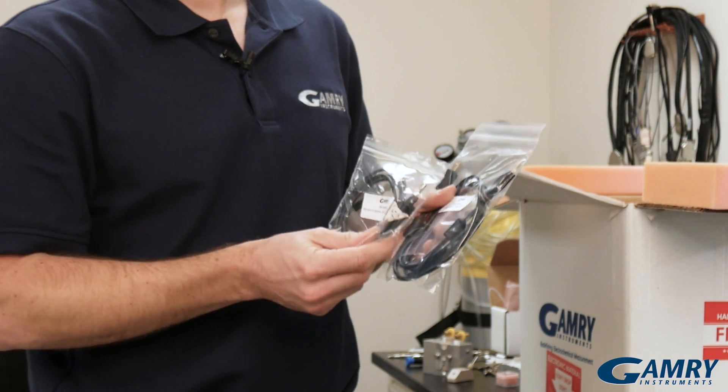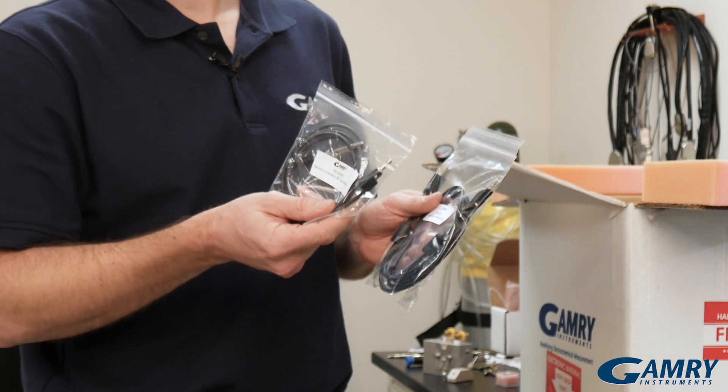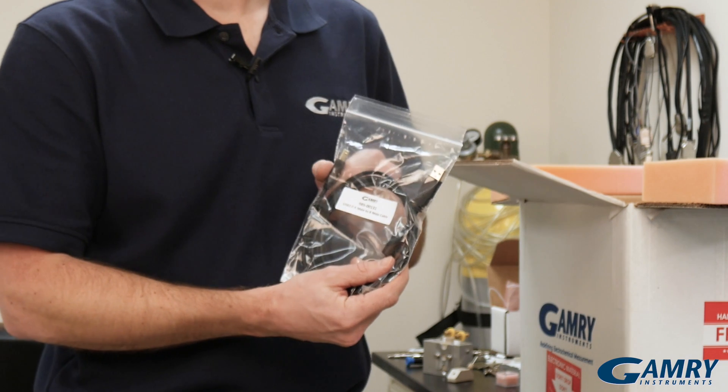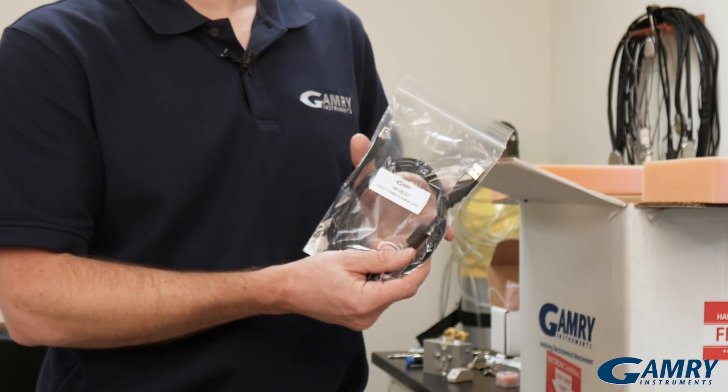The first two things we come across when we open the box are a grounding cable, which is used to ground a potentiostat to an earth ground if necessary, and a USB cable, which is used to connect your potentiostat to a computer.